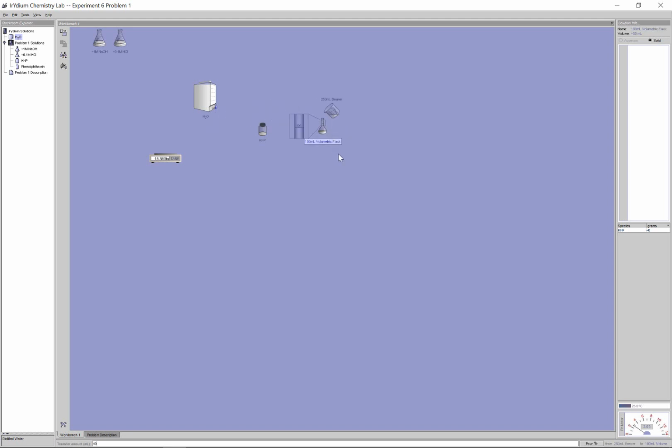My goal here is to just make sure I am under the 100 ml mark. I added in 30 and 40. It looks like in this container here, yep, so there's some imprecision. There's still some extra volume here. Let me just pour in that extra. I don't know how much there is.